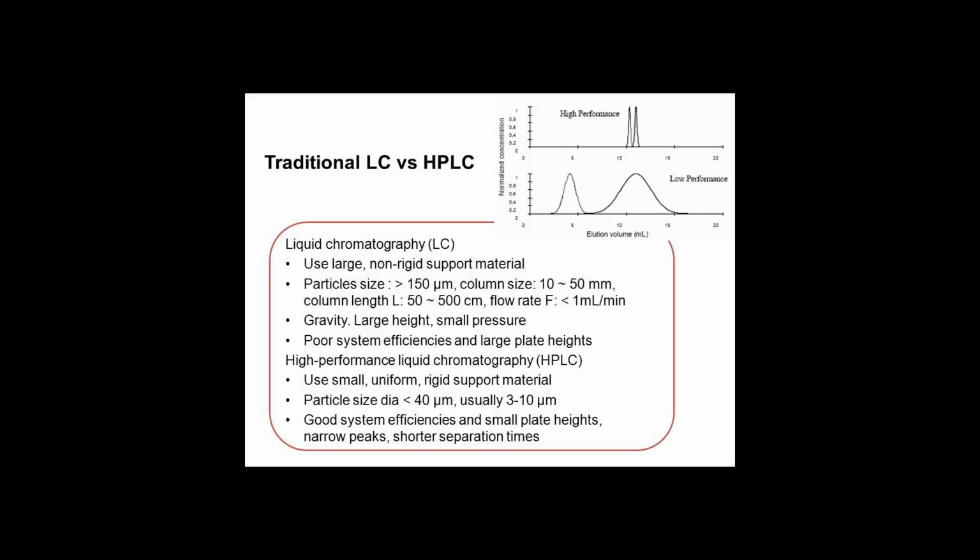However, by decreasing particle size, new problems arose. The practical disadvantages stem from the excessive pressure drop needed to force mobile fluid through the column and the difficulty of preparing a uniform packing of extremely fine materials. Every time particle size is reduced significantly, another round of instrument development usually must occur to handle the pressure.